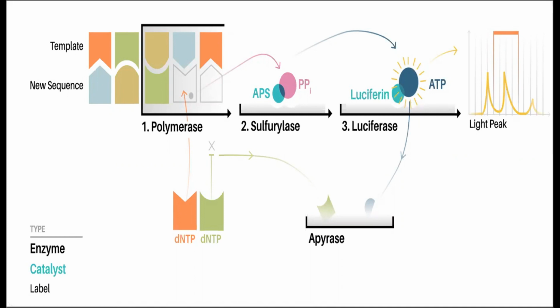Now you can adapt this process according to your need. You can do this in a solid state, or you can go for a liquid state as well. In liquid state, because you can't wash off, right? As soon as you wash off your device, your target DNA will also wash off. Then you are not left with anything to go on with the experiment. So in a liquid sample, you don't go for wash off. What you do is you apply another enzyme known as apyrase. What this apyrase does is the same process over here, but without making your DNA stick to a solid surface. That is the only difference between a solid pyrosequencing and a liquid pyrosequencing.